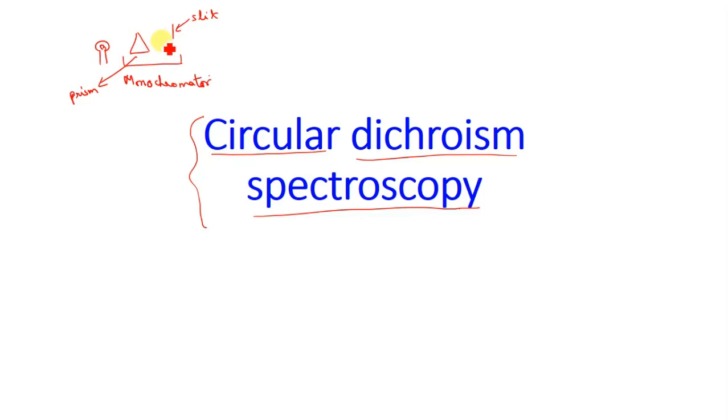So the light of specific wavelength comes out over here. Then we have the sample. The light interacts with the sample, which if it is liquid is kept in the cuvette, and then the radiation goes out, and we have a detector to capture the radiation.